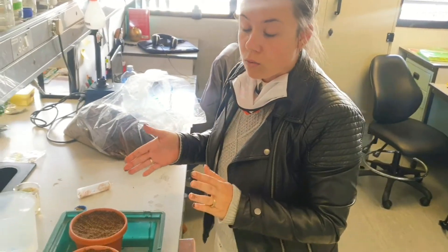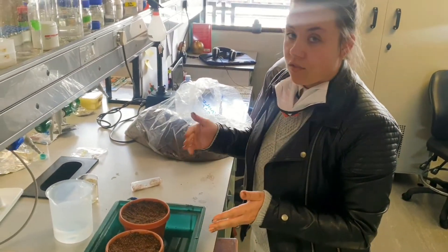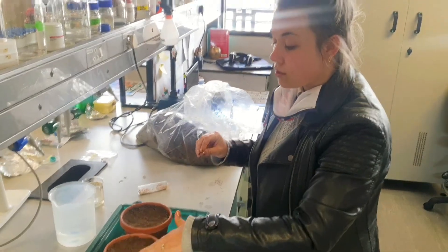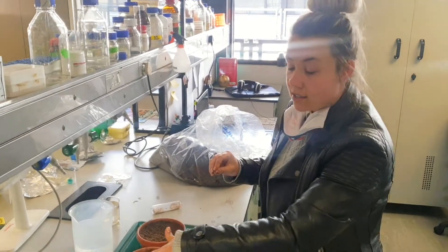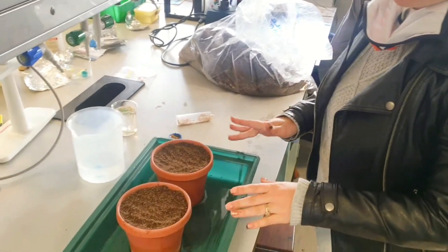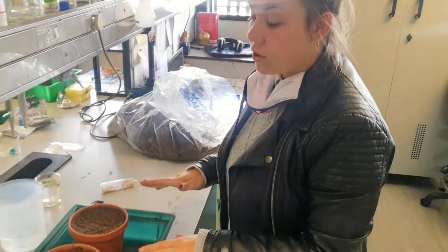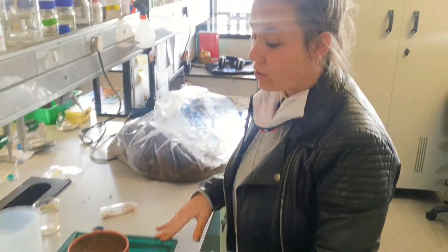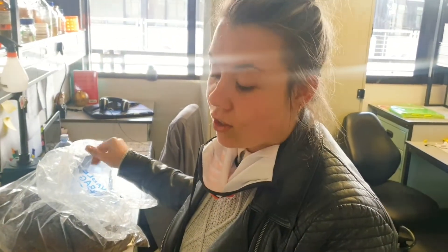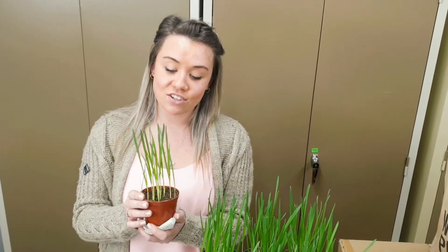I water them twice a week — on Mondays and Fridays — and every other week I add some fertilizer to the water, not too much, just enough so the plants are nice and healthy. They normally germinate within three to four days. As you can see, these are my own plants that I planted previously — they are now two weeks old and look very healthy.